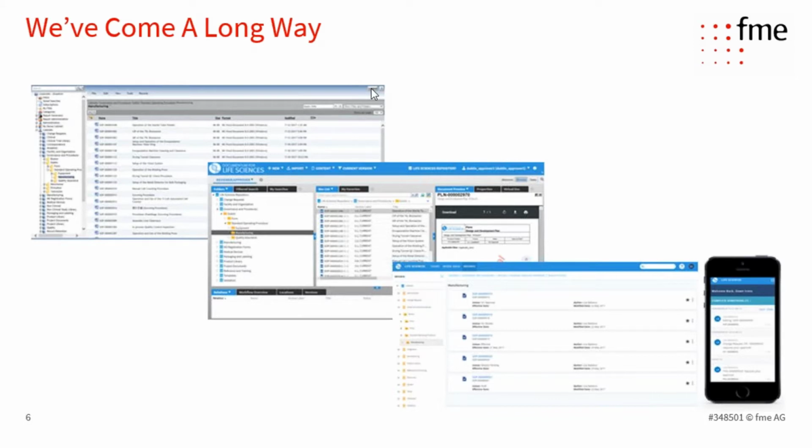This is just a quick highlight of how we've come a long way in terms of the Documentum portfolio, the suite. For those who have the historical familiarity with the platform, you can see the Documentum Webtop client. Now we have what we'll talk about and see today, the Life Sciences Suite founded on the D2 framework, a prepackaged solution.